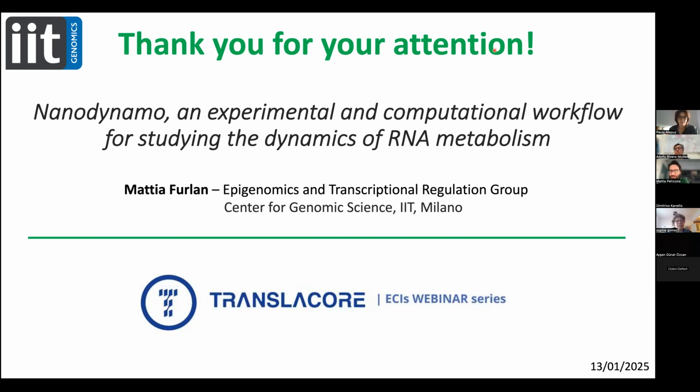Okay, thank you. I guess, Paula, you have one question because you have your hand raised. Yes. So thank you for these very nice talks from Mattia Pelizzola and Furlan. I have 3 questions. The first 2 are about the technique, and then the third one more conceptual. The first is just because I'm interested. Did you apply this Nanodynamo to yeast cells? No, we have just applied it to K562 so far.